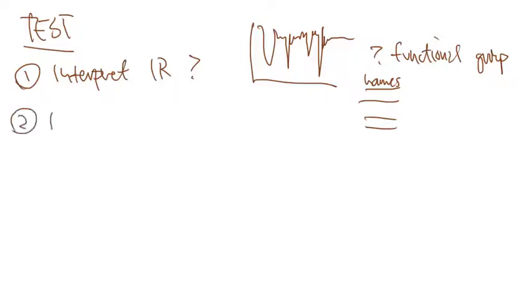Number 2, there's going to be theory, of course, that's involved. So if you're putting a sample into the machine, why is it absorbing light? How does it absorb light? What goes through that process of getting the light to the detector? What is the theory that goes along with this whole setup? Why does it work the way that it does?